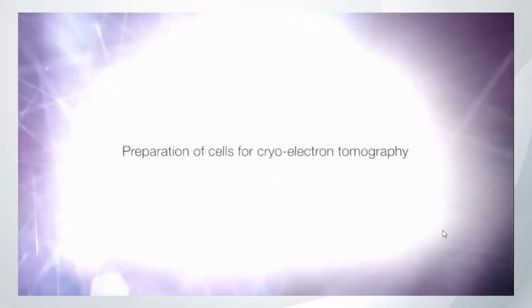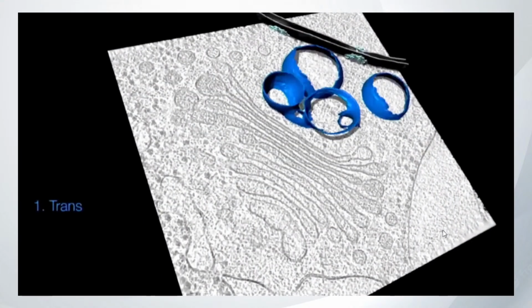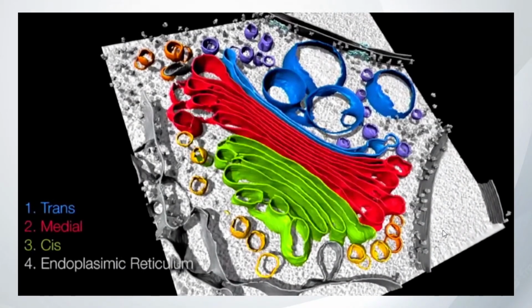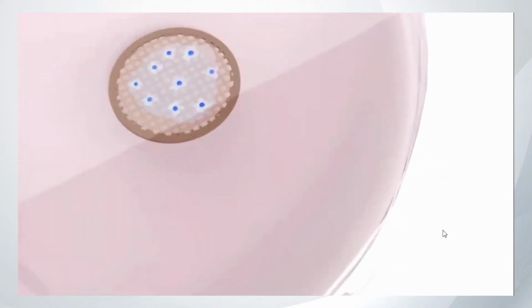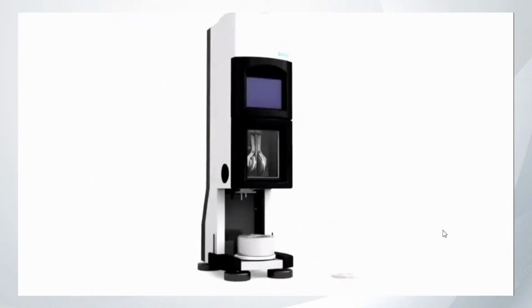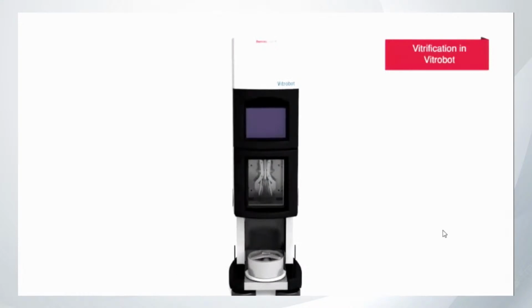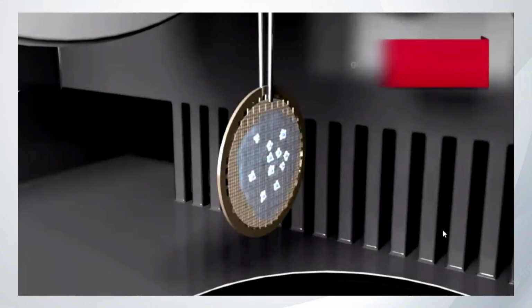So how do you prepare the cells? And this is very cool. This is the kind of result that you will be able to obtain once all the segmentation, tomogram and subtomogram averaging is done. The first step, as I say, is you grow the cells on your cryogrid. And this is the tricky part. Once your cells are very happy there, you use the VitroBot. Again, it's the same machine I explained before for single particle analysis, to vitrify those grids or vitrify those cells.